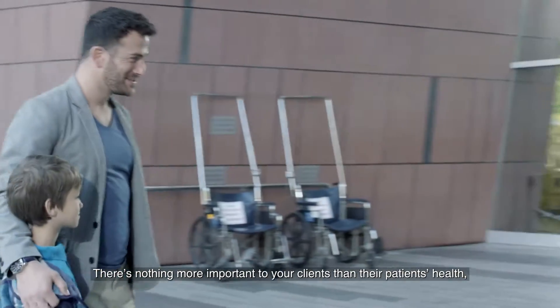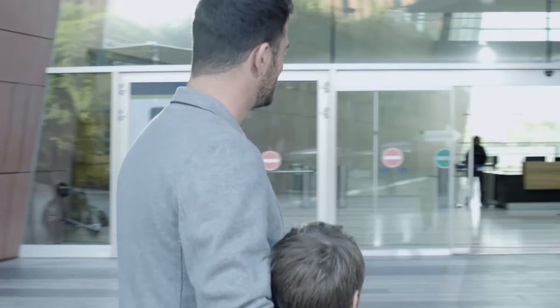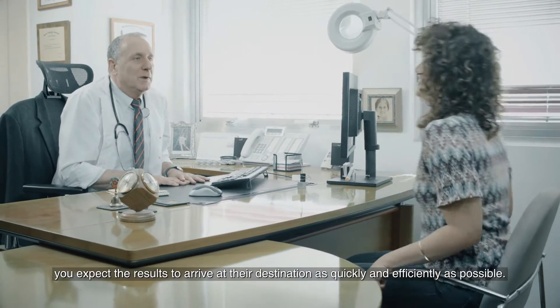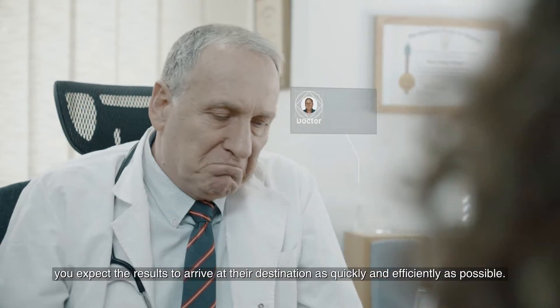There's nothing more important to your clients than their patient's health, so when there's a need for lab tests, you expect the results to arrive at their destination as quickly and efficiently as possible.